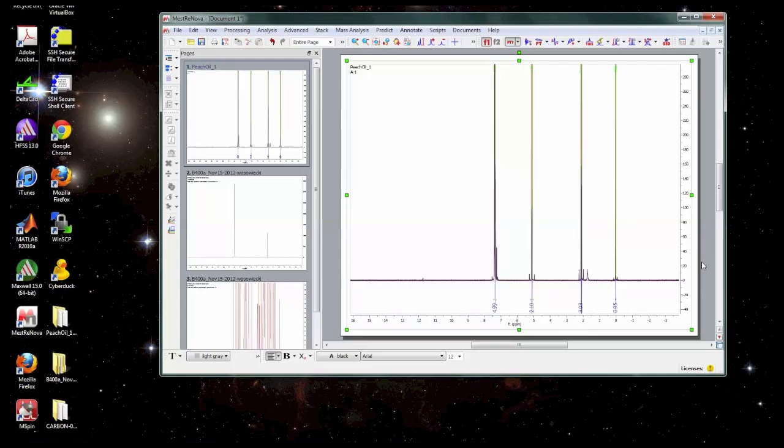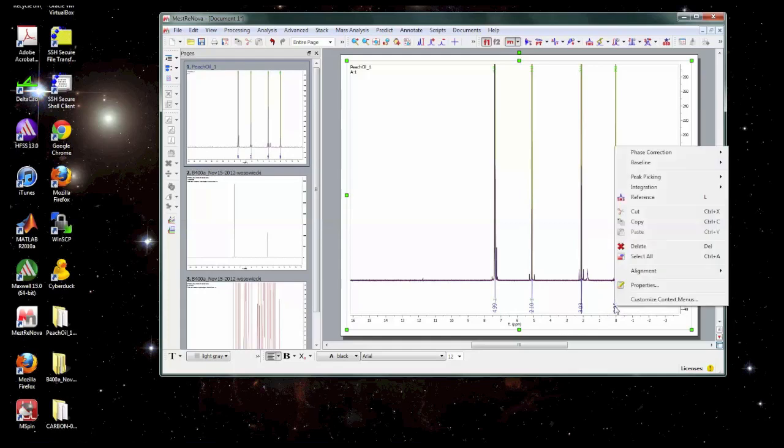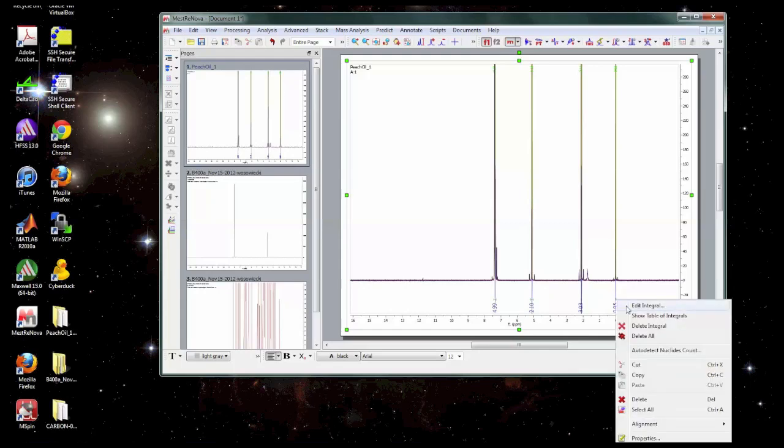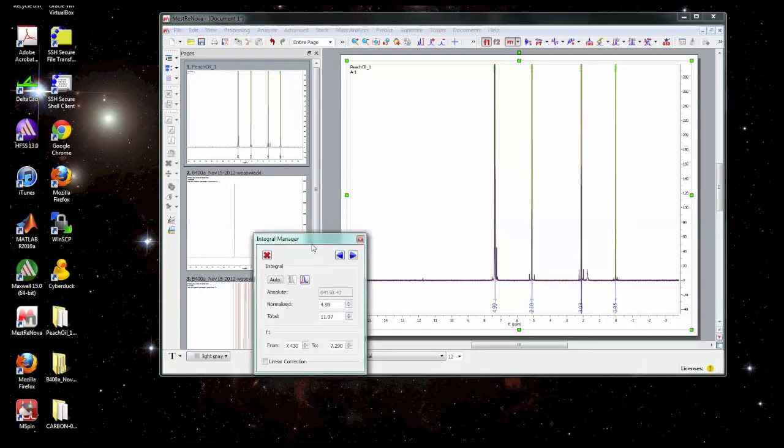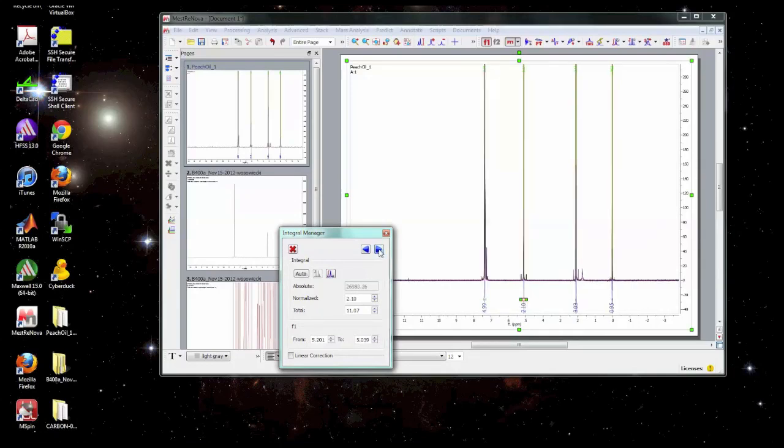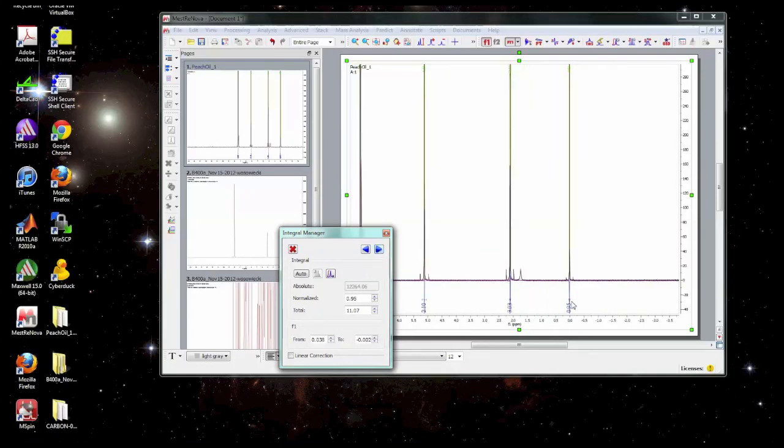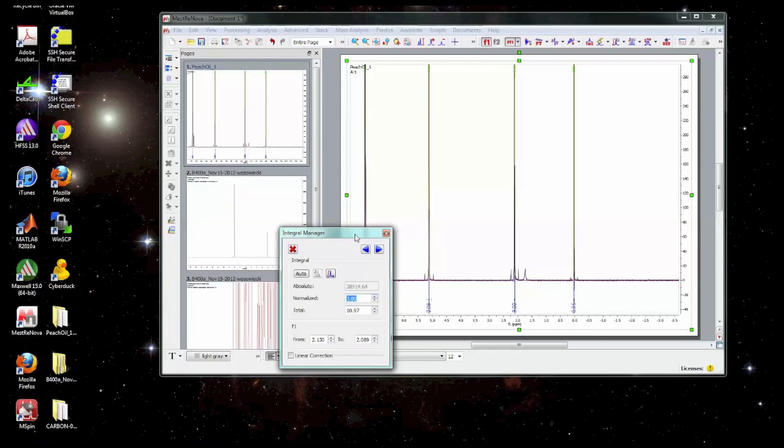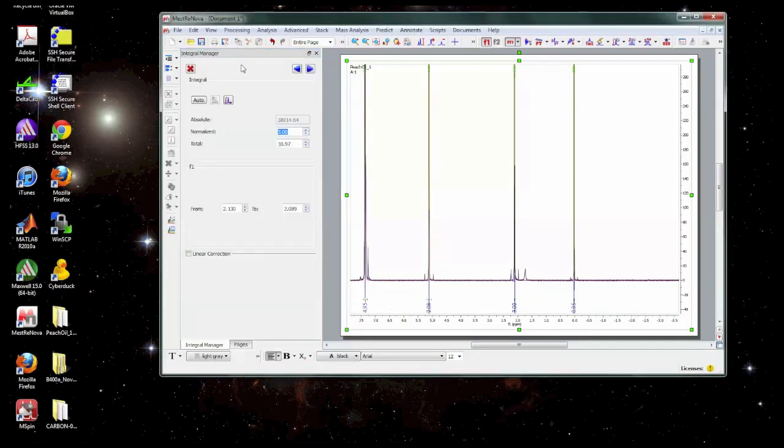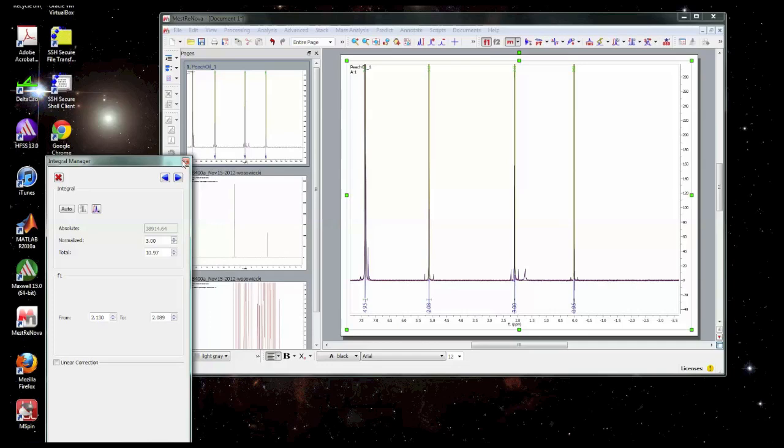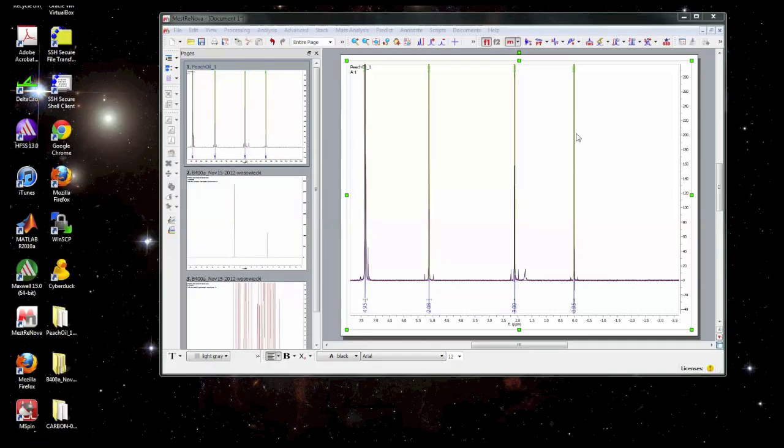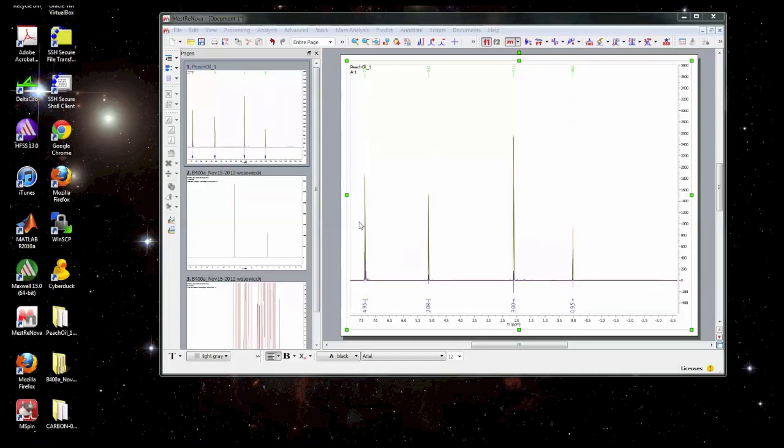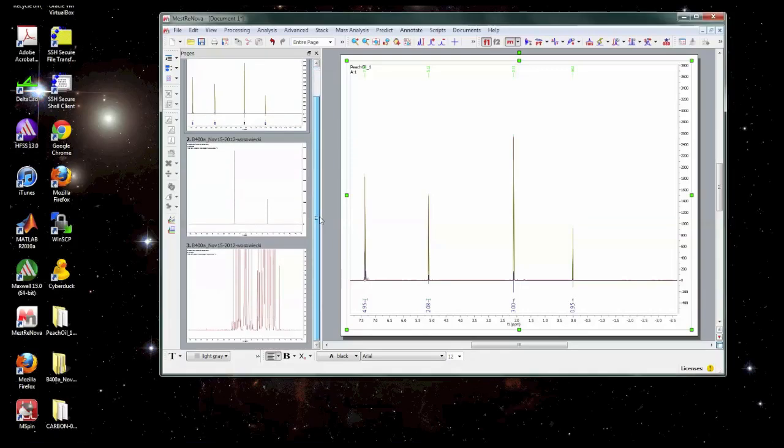Once you've got the spectrum integrated, then you could go in and normalize it. You can go there by right clicking on the integral, go to edit integral, and you can pick which integral that you're editing. So I'm going to choose this one, for example, and set it to three. And it will update all of the other values to be based on that integral. Okay, once we've got all our integrals set, then we can move on to the next step, which in this case, there's not much to see because each one of these peaks is a singlet. But in some spectra, you will have multiplets. So we'll move on to this spectrum here that has a lot of peaks.